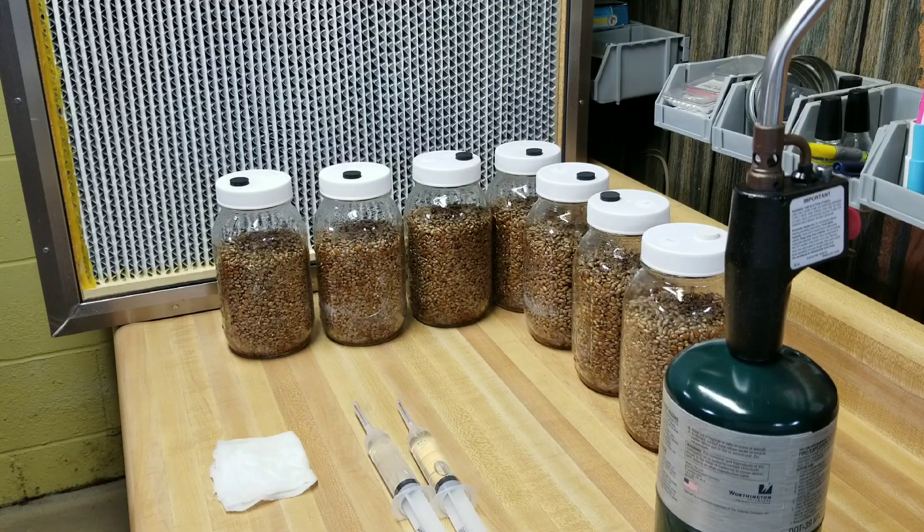One thing I want to mention - this drives the sterile tech Nazis crazy - I do flame the needles on my syringes and after I flame them I wipe them with an alcohol-soaked paper towel to remove the soot. I know that's technically not perfect sterile technique, but I've been doing it this way for 20 years and never had any issues. Wiping the needle with an alcohol-soaked paper towel does not contaminate the needle.